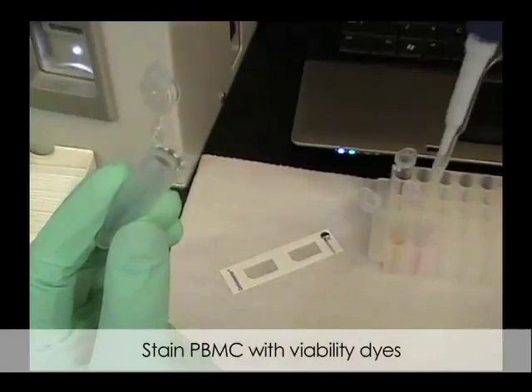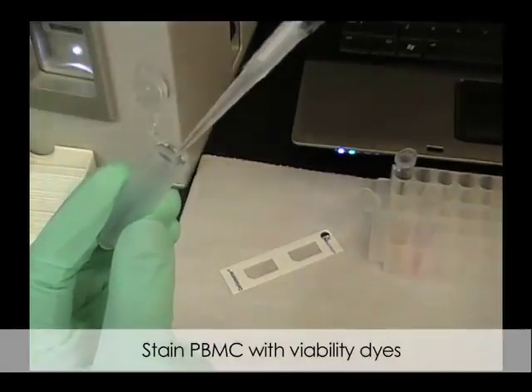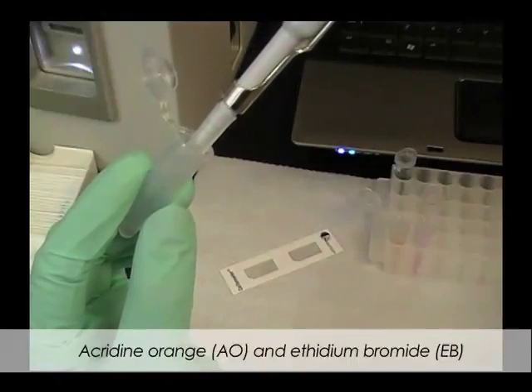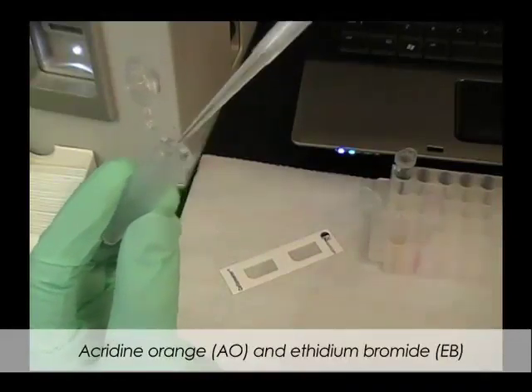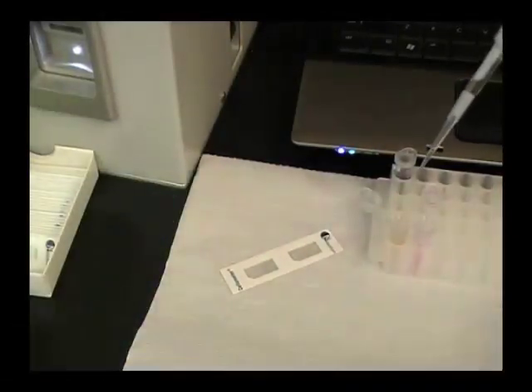Nucleus staining dyes are added to the PBMC sample. In this example, acridine orange and ethidium bromide are used.